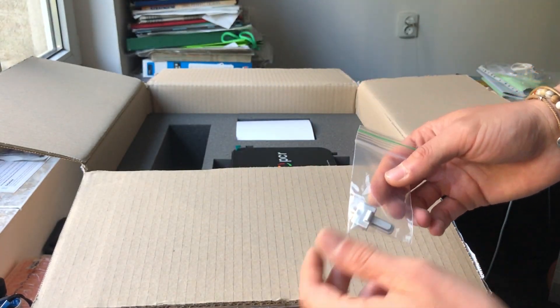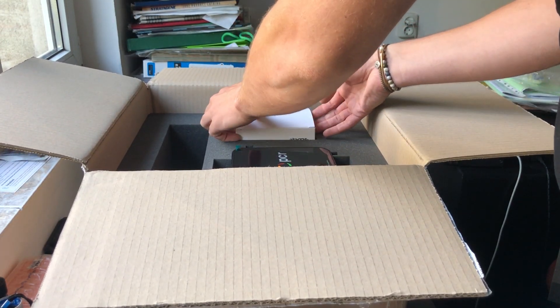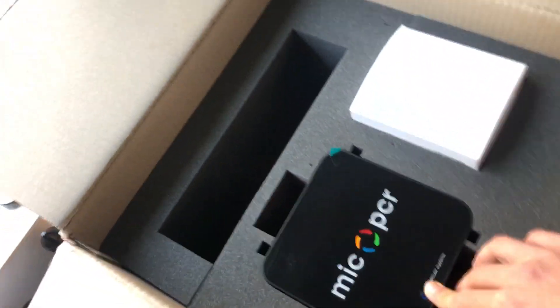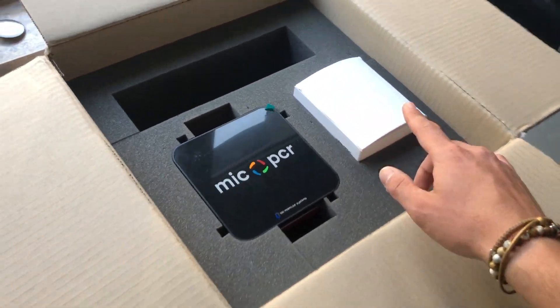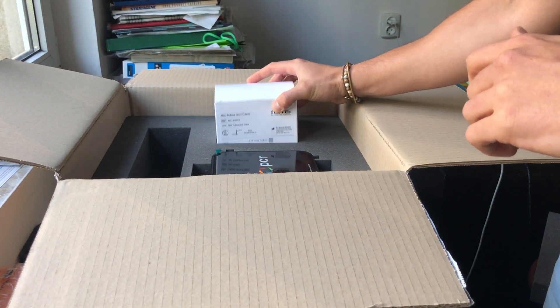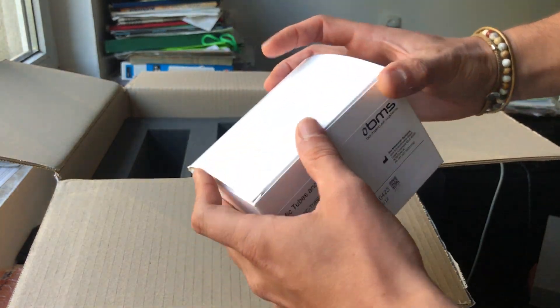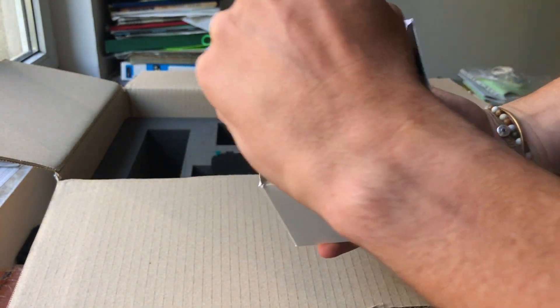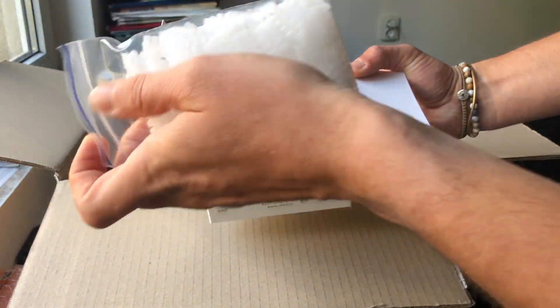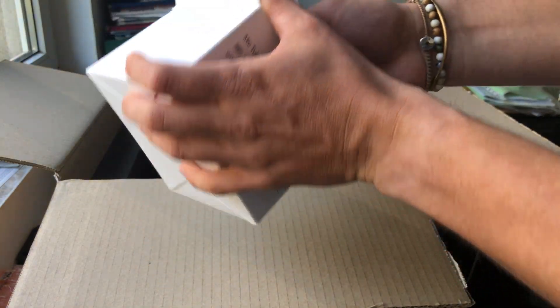There's also a USB stick and some caps, probably for transport. Here's the PCR unit and here's another box which probably contains some proprietary tubes. Yeah — 960 tubes and caps. The caps and tubes come in little boxes.